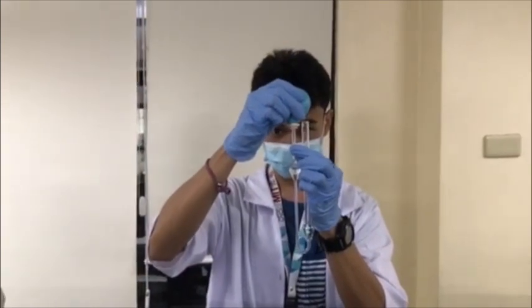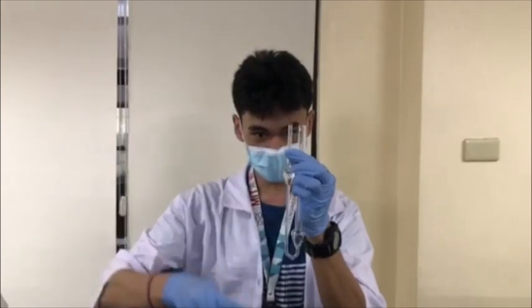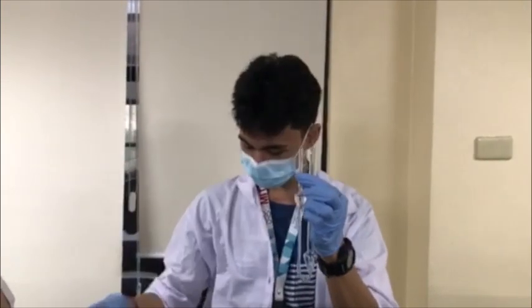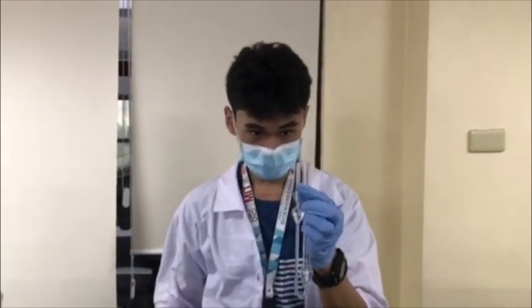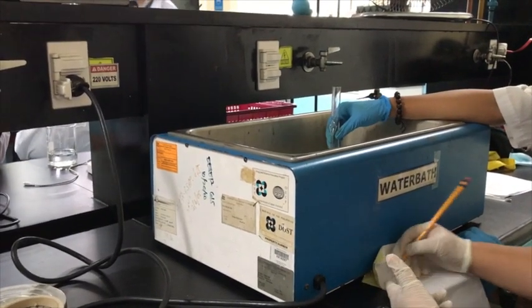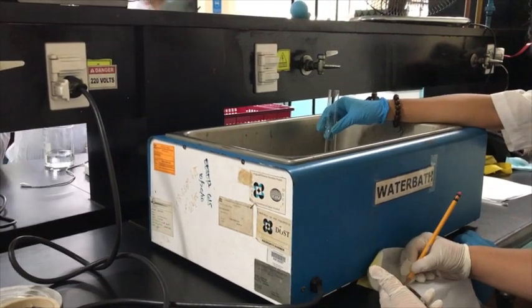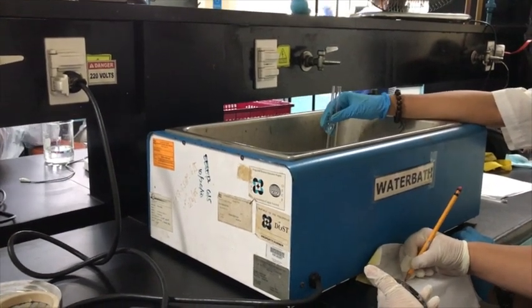The second part involved identifying the effect of changing concentrations of solutions. This portion involved preparing varying concentrations of sodium chloride solutions. The third and final part involved determining the effect of increasing temperature of solutions against viscosity. This portion used water at different temperatures as the test sample.